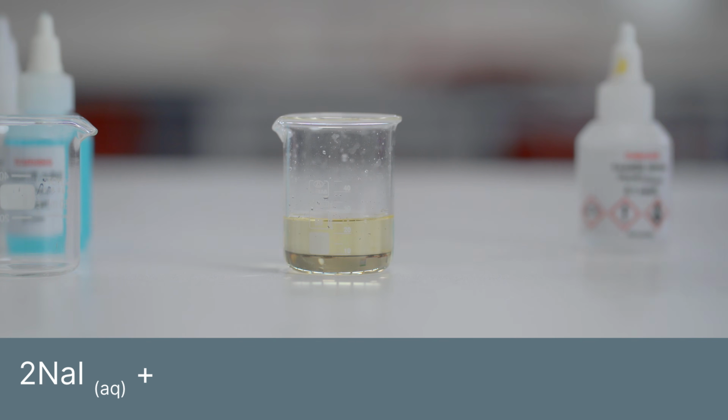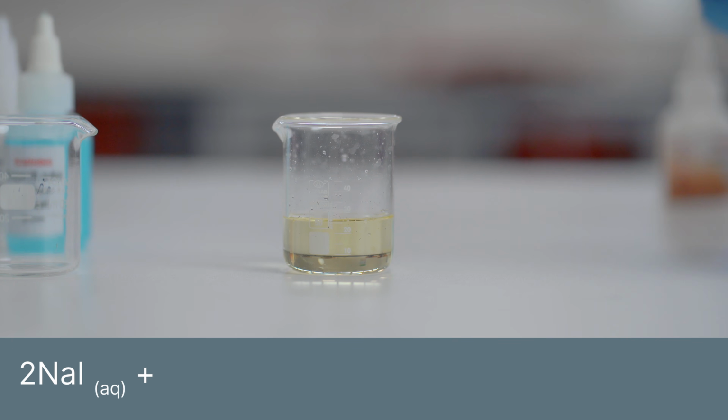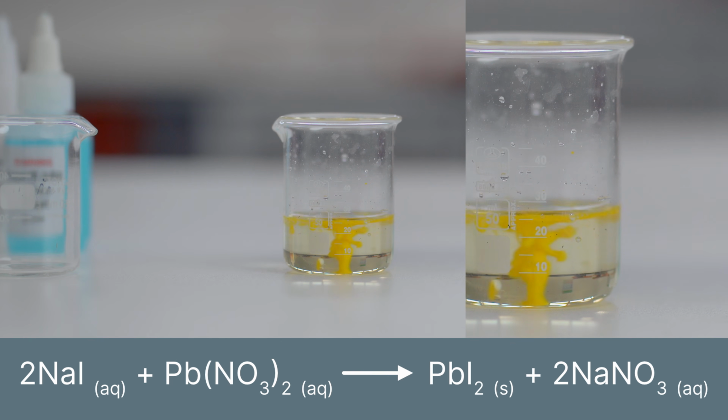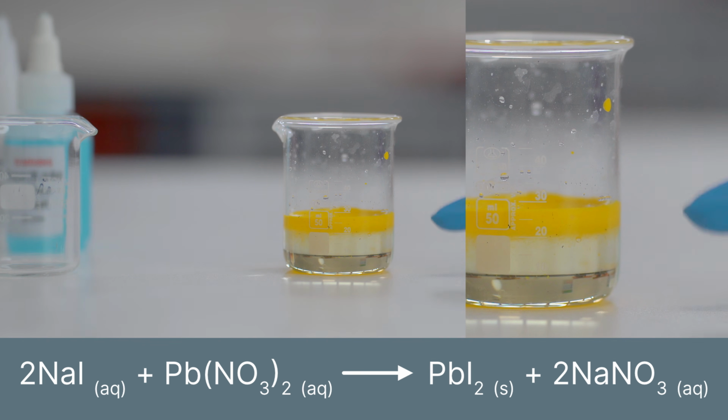The sodium iodide compound here is quite transparent. You can see quite through it. It's just a little bit yellow. So now we're going to add our lead nitrate. And I'll just add a few drops. We can see that where the drops met at the surface, we have the precipitate forming, and hopefully on the camera you can start to see that it'll eventually start raining down and settling out.